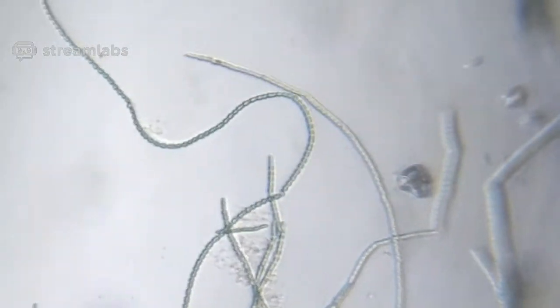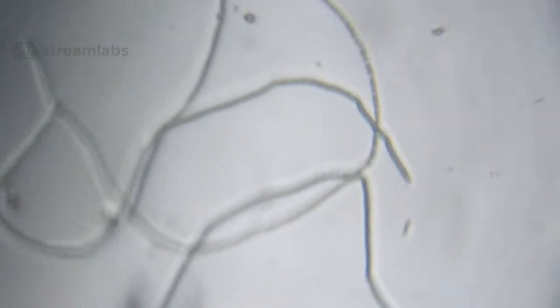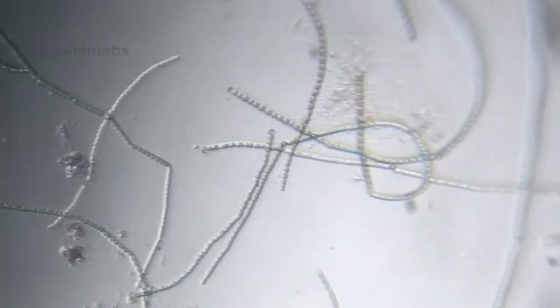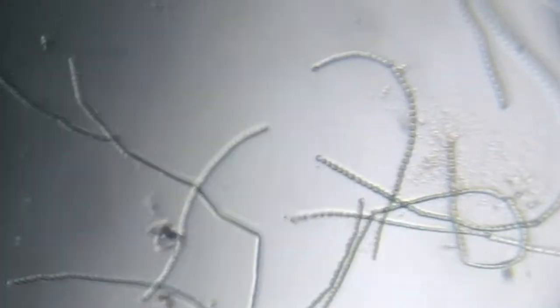It's a cyanobacterium. The great thing is, you've read about photosynthesis, right? Much of the photosynthesis on Earth is done by bacteria, believe it or not. And here you have a cyanobacterium, and often some of these cells also fix nitrogen. These are very special cells.